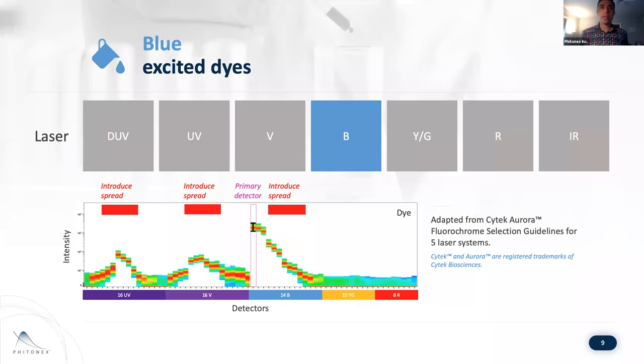And so when we think about what that means, it means in the context of thinking about this, but also thinking about it in the context of, well, only the signature matters, is that, you know, we love looking at these ribbon plots because it actually illustrates a lot around dye performance, right? And this is amazing work from the SciTech team in characterizing a lot of these labels. And I've taken this image from them and shown, look, it's great, PE and all these PE conjugates have this behavior.